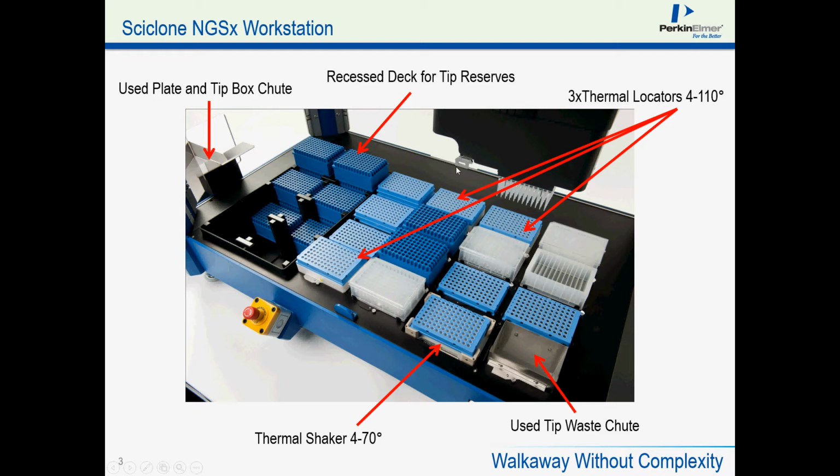There is also a gripper. This is the main head that we use to do our pipetting. But on the left side, in this little section, there's a robotic gripper that can come down at various heights and grip plates, tip boxes, and lids, and it's a very valuable tool in this setup. Over here, where you may see tips hanging, these are 96 tips, and that allows us, if we wanted to do a full plate transfer, to do a full plate transfer.